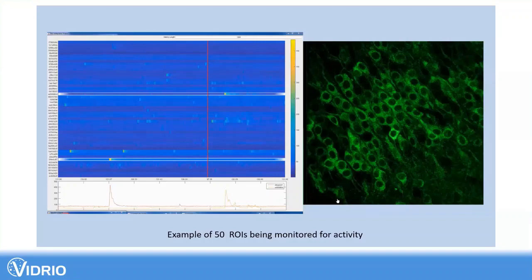I have a quick question. I don't know if it's a good moment. Yeah, go. So when you generate holograms, what type of algorithm are you using? Because in general, these algorithms are very time consuming, especially as the number of points that you want to modulate increases, as Nico showed in the first day. So what is your approach here to generate these holograms?